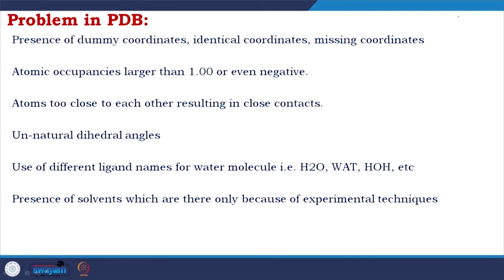Presence of solvents which are there only because of experimental technique, mainly in crystallography. To get crystals we use a lot of conditions, and that brings many ligands to be incorporated or involved in the actual crystal structure. They are misleading most of the time, they are creating a non-biological environment.